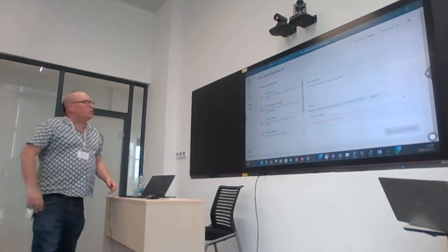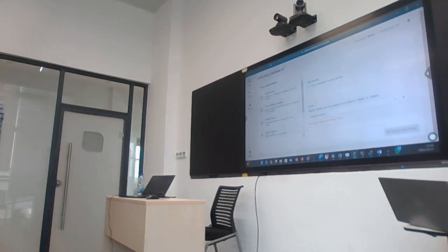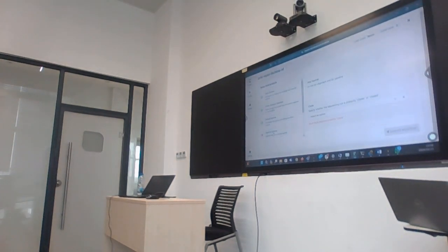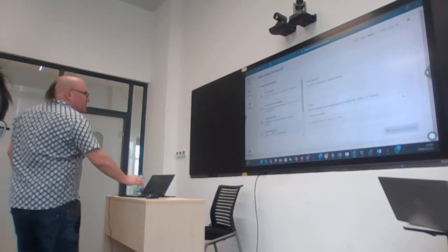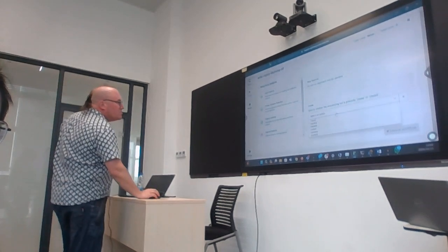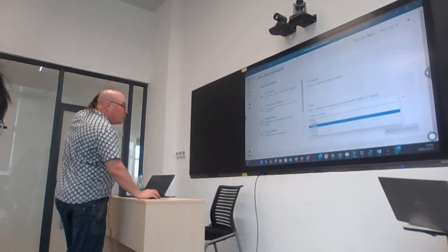The last thing we need to choose is for the squirrel. Which kind of squirrel do you like? Do you like a red squirrel, a gray squirrel? Do you like this little albino white one? No, I'm joking. Squirrel also needs to know which clade you are analyzing. Okay? So for squirrel, you must select an option, and we must select clade 2.